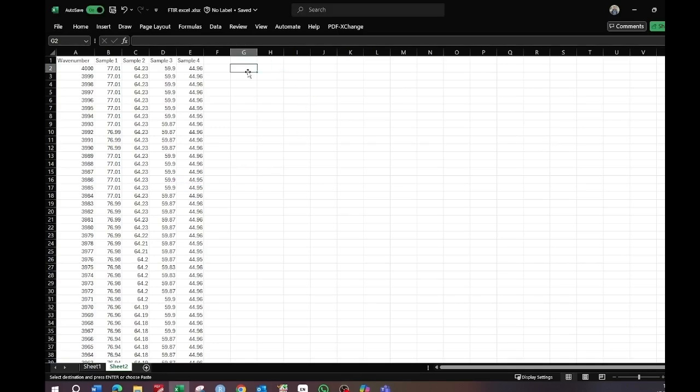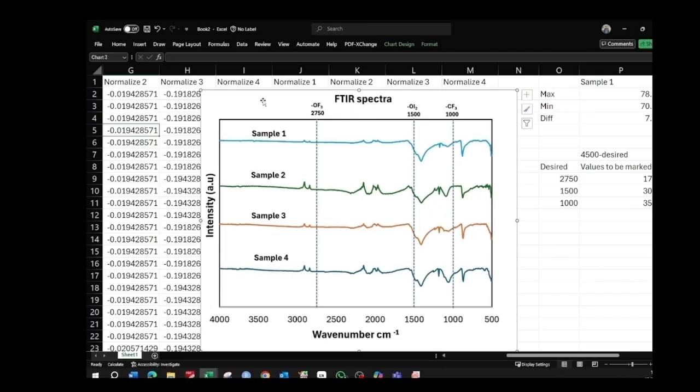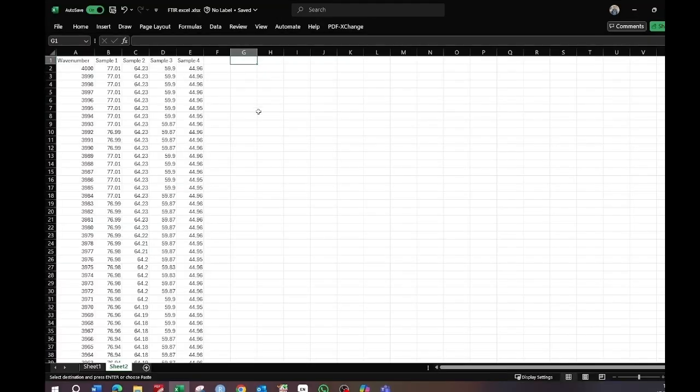Hello, today we will see how to make an FTIR graph in Excel. At the end of the video the graph will look like this, so kindly follow all of the steps. We have possible values of four different samples and a wave number.